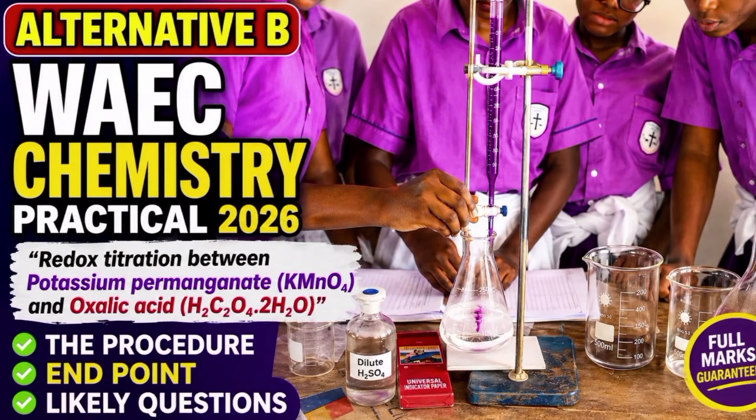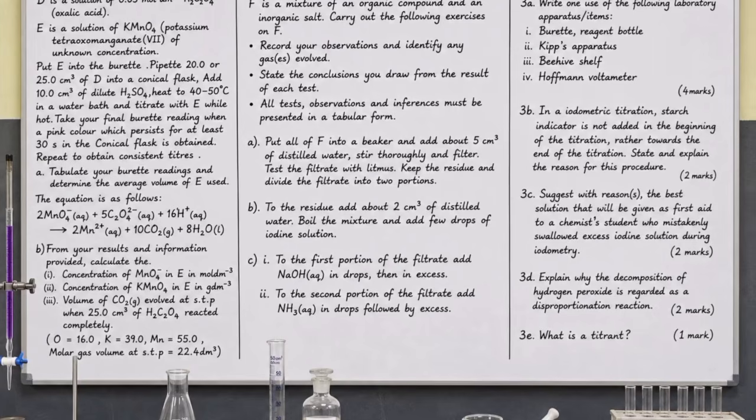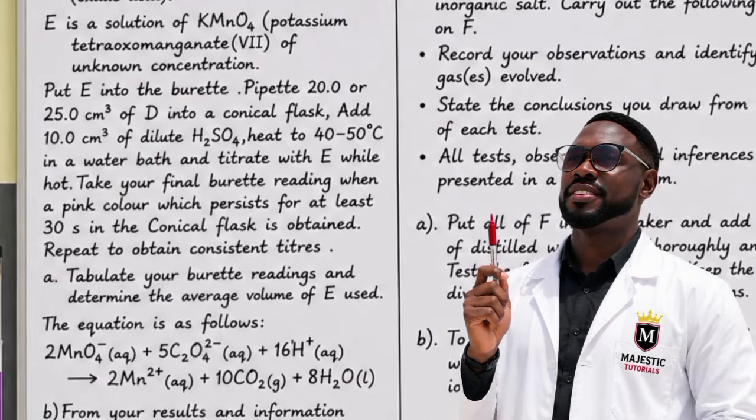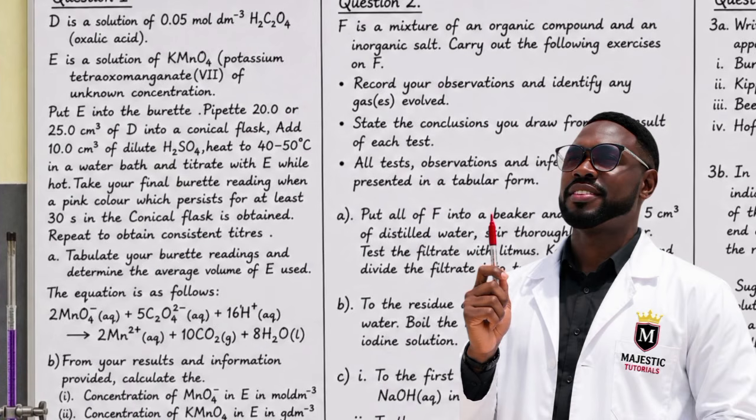In this video, we'll be handling this redox titration and equally the salt analysis together. I'll first of all show you the likely questions. These are the likely questions. Then, this is likely question 1 for titration. This is the question 2 for salt analysis.